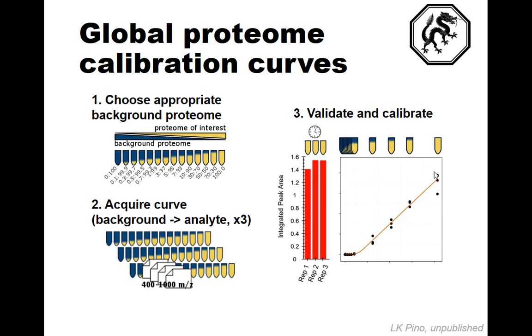So some examples: what I've been doing is using yeast in a heavy labeled yeast proteome, and not using the peak area ratio, just using the heavy labeled yeast to be an exact chromatographic complexity match. But you can imagine maybe pairing a Cerevisiae strain with a Pichia strain, something diverged enough, but still similar complexity at the proteome level. Sandy in the lab has been trying this concept using human plasma with chicken plasma, something that should be about similar chromatographic complexity, but diverged enough to be different.